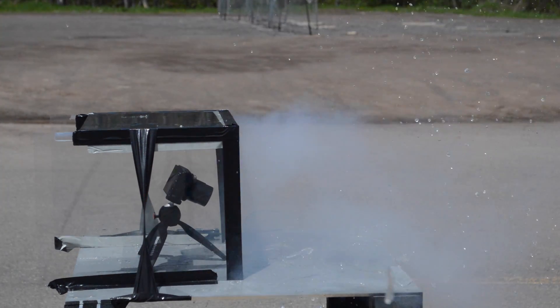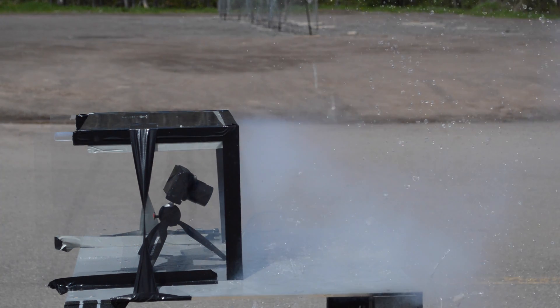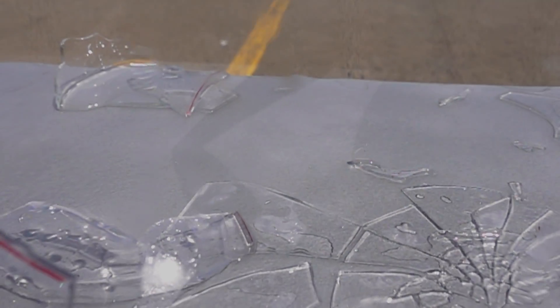Run. As you can see, the reaction of sodium with water is somewhat energetic.